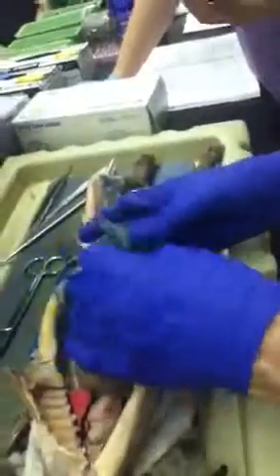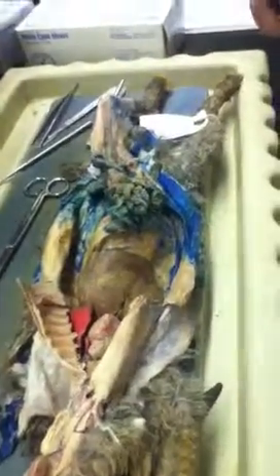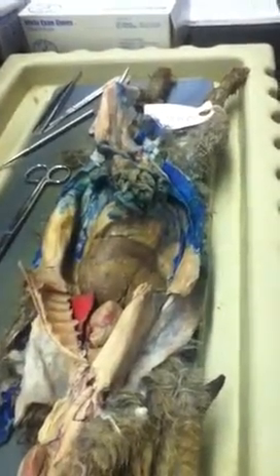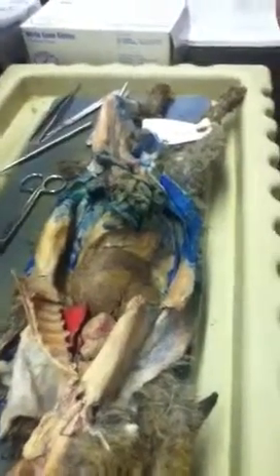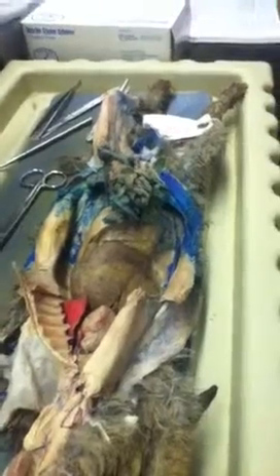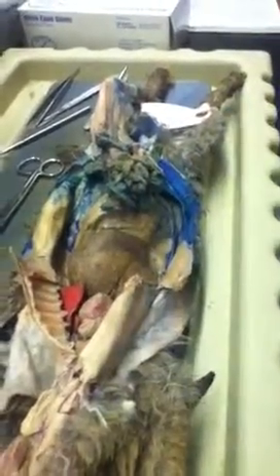I've ripped a lot of mesentery here, but even within the intestine, there's mesentery connecting one part to another. And if you think of, well, why is that? Remember, when the organism formed, the digestive tube was straight, and there was mesentery suspending it dorsally. And as that tube gets more and more complicated, the mesentery just kind of gets bigger and bigger and bends with it. So that original straight mesentery gets all crinkled as the intestine folds.